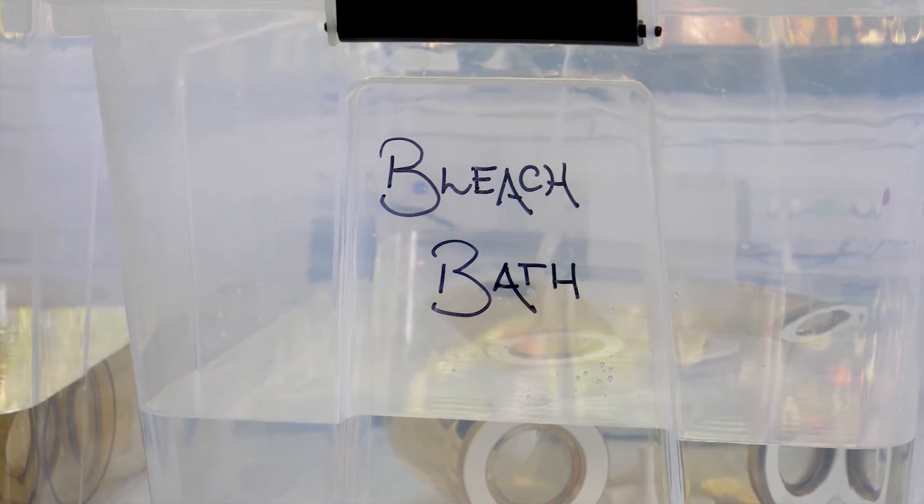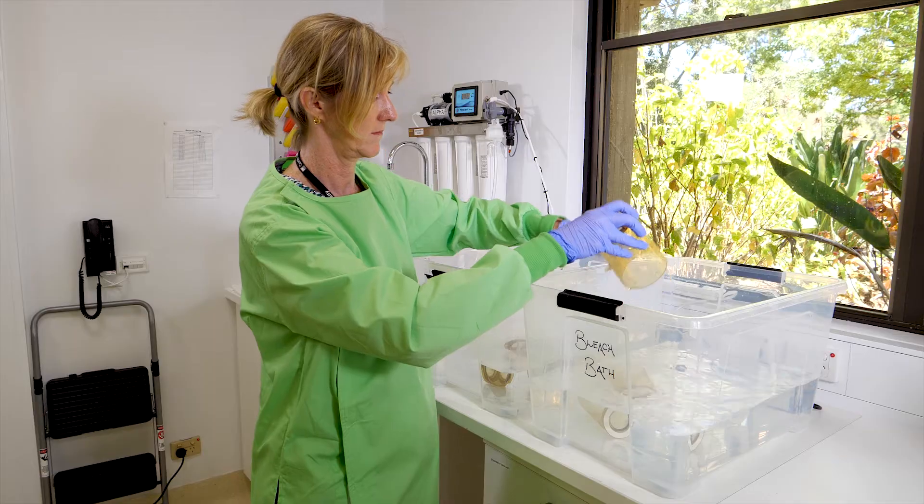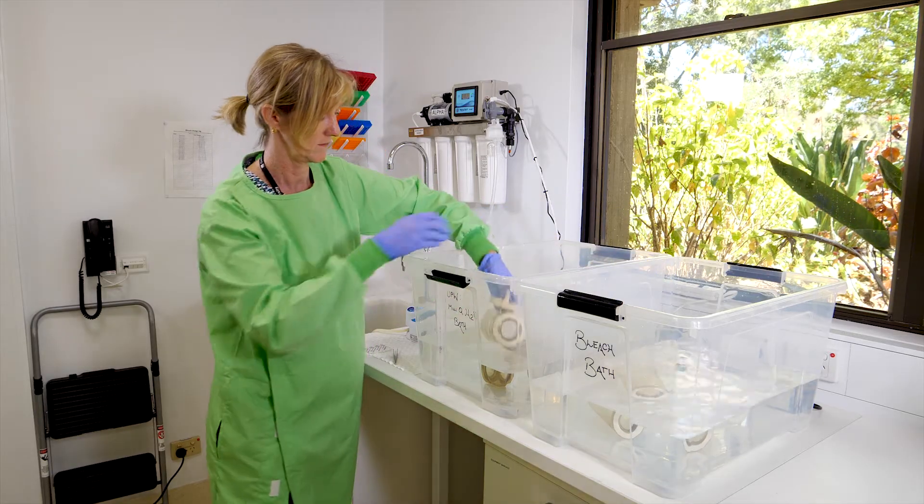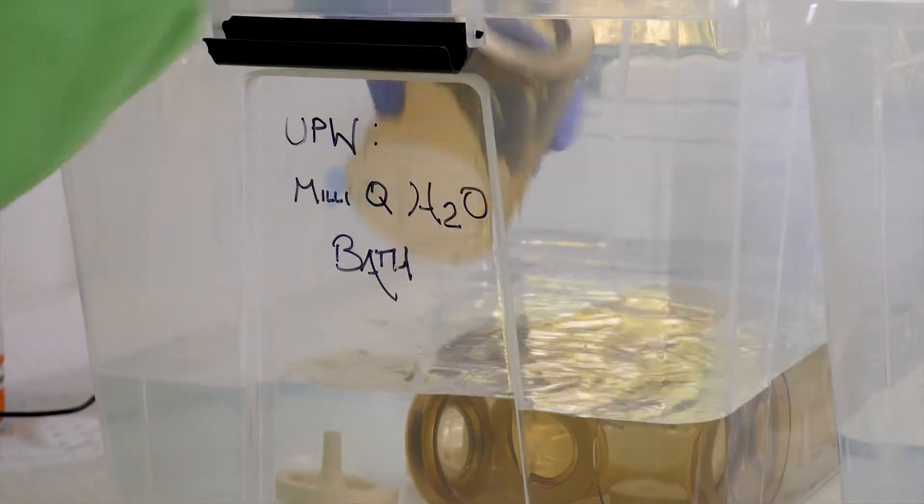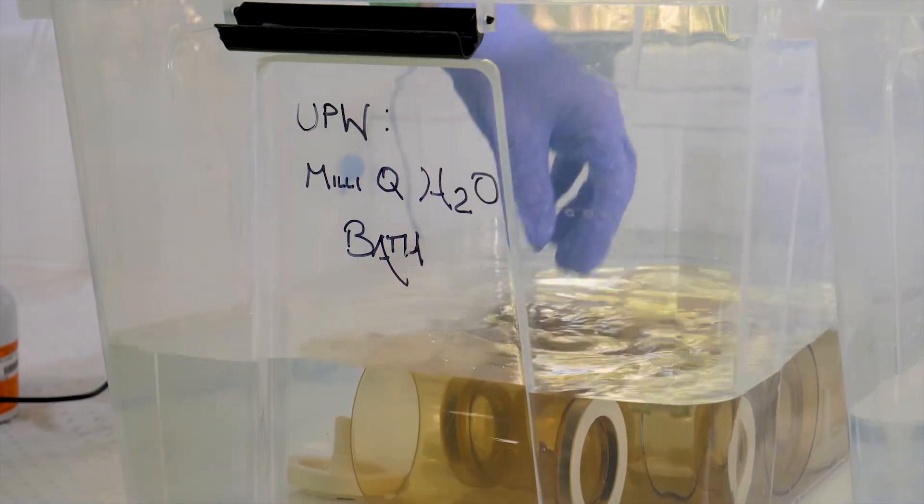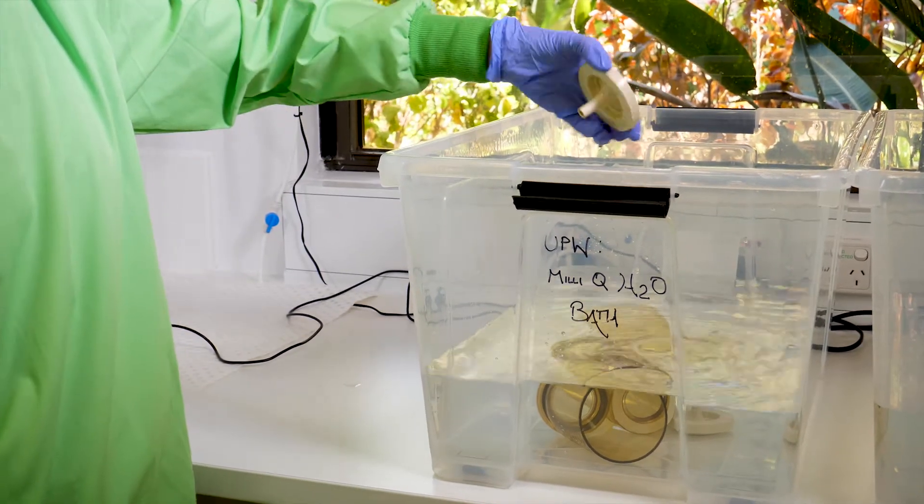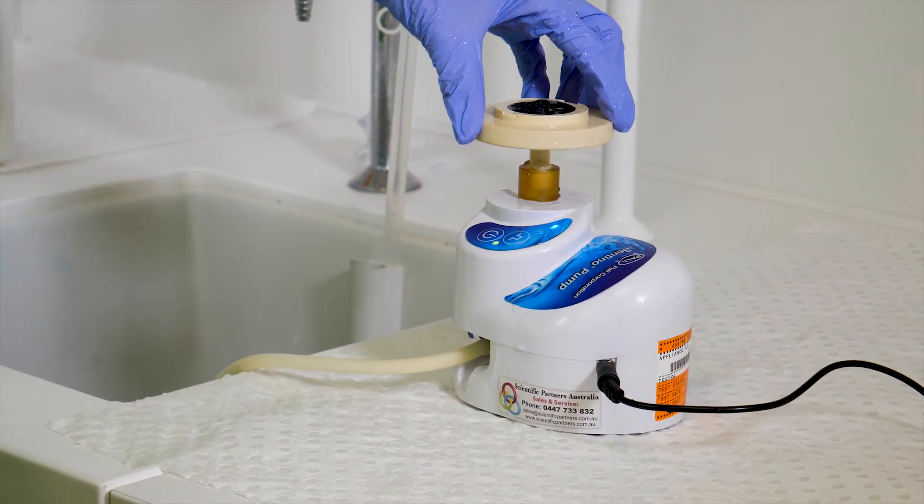After 15 minutes of the funnel and the filter base soaking in the bleach, remove the items and transfer them over to the rinse water to remove residual bleach from the apparatus. This needs only to be a rinse, but make it thorough enough to ensure the bleach is gone or it may degrade the DNA in the sample. Connect the filter base to the pump system via the tubing connector as shown.